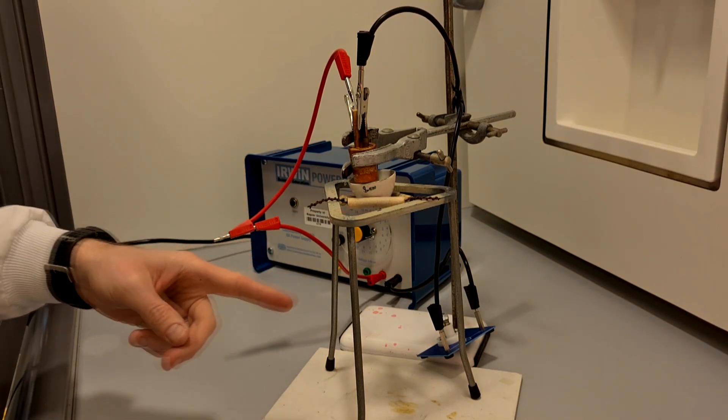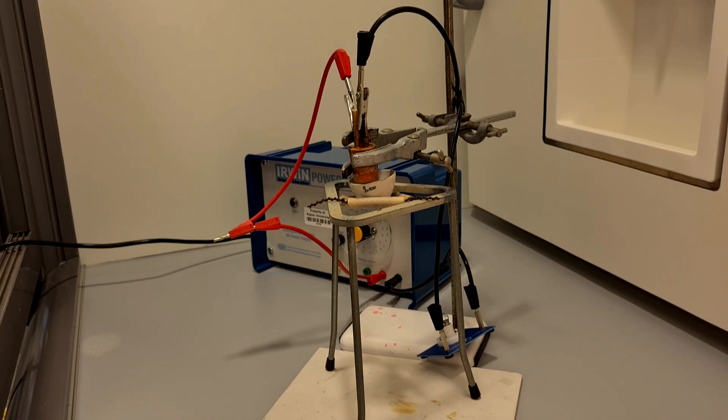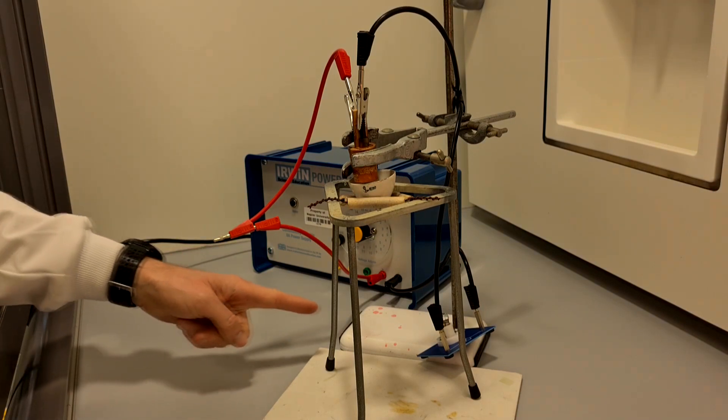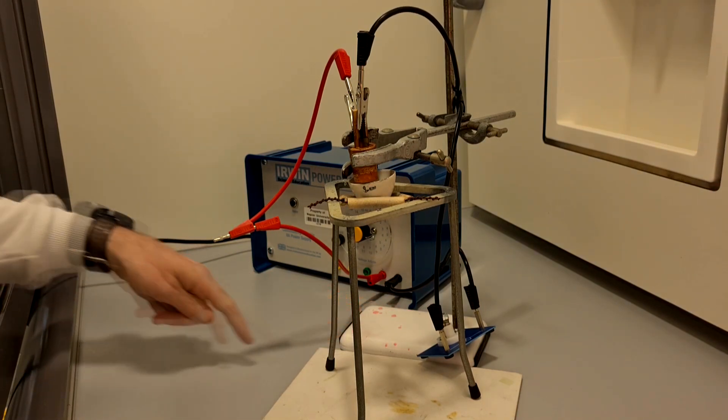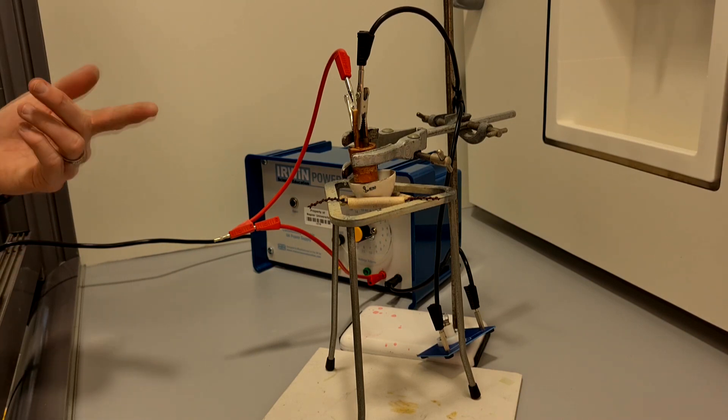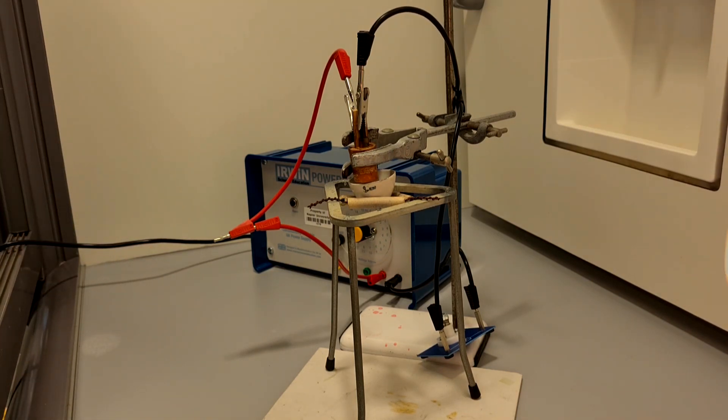I'm going to move the Bunsen burner under the crucible containing the zinc chloride powder and gently heat it so that it melts. And what we are looking for is to see if this light bulb lights up indicating that the circuit has been complete, so therefore the zinc chloride melt conducts electricity.